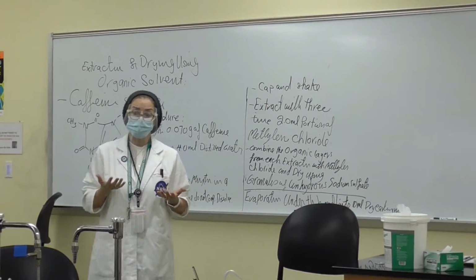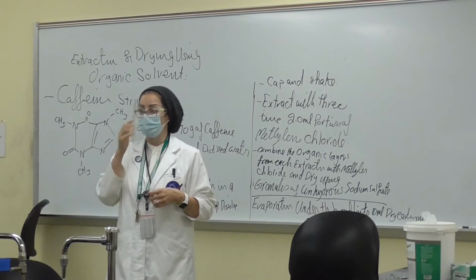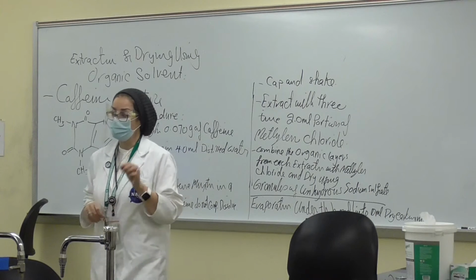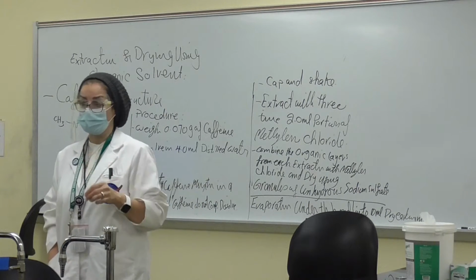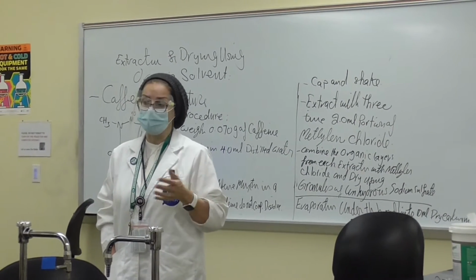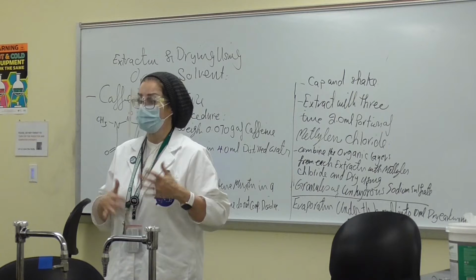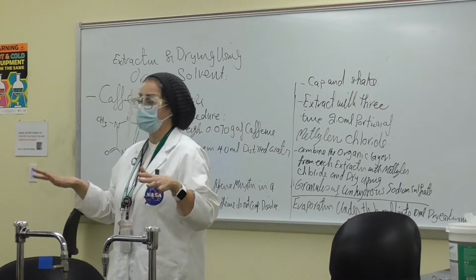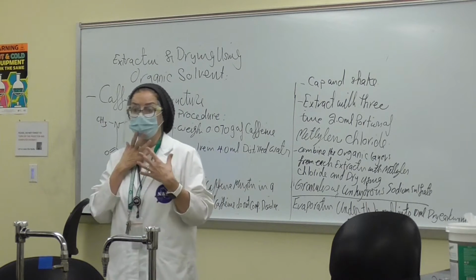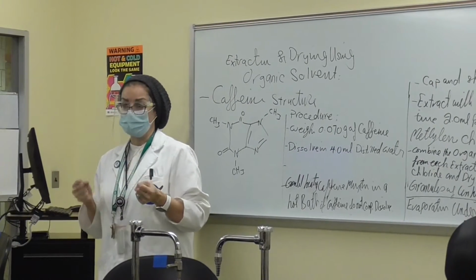What we are going to do today is use methylene chloride. Methylene chloride has to stay under the hood when you heat it, in other words evaporate it. It has to be dealt with very carefully because it has some hazards, one of which is cancer. If you use it long term, frequently, use gloves, and luckily we also have masks and goggles, so be careful dealing with the methylene chloride.